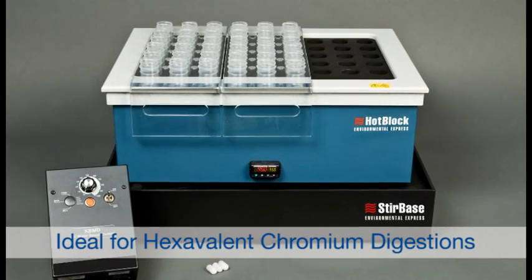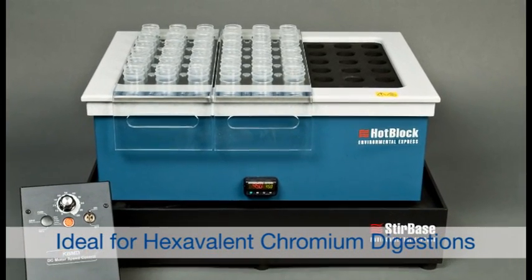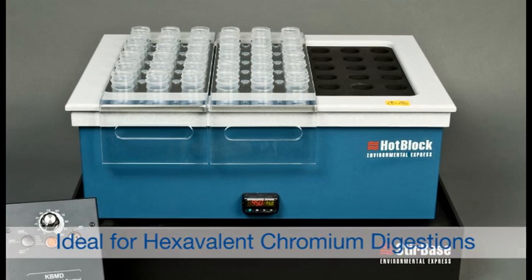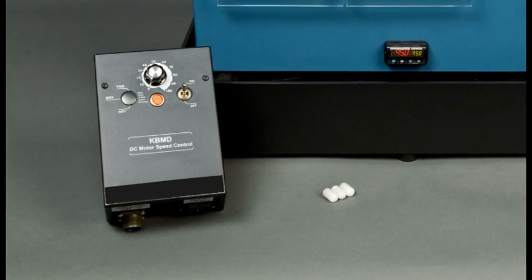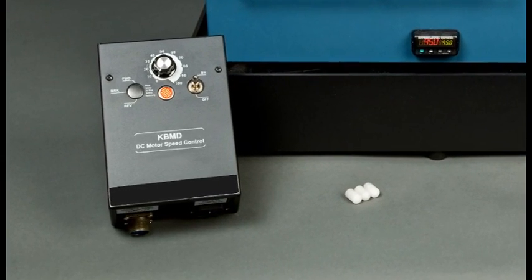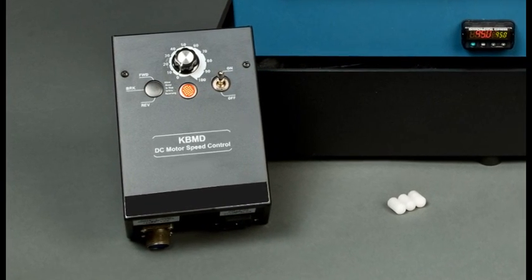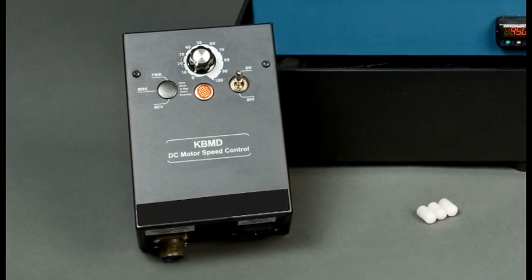The Environmental Express Stir Base also utilizes hot block technology while allowing constant stirring of your samples. The mixing speed is easily adjusted using the accompanying controller with a six-foot cable, eliminating the need to be inside the hood during digestions.